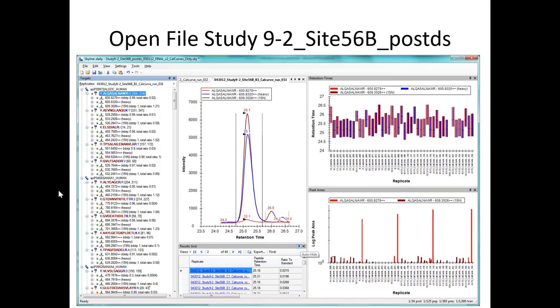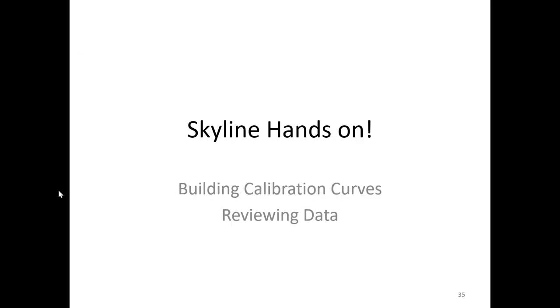Okay. So we've got 40 minutes to do some hands-on work, and we'll be building calibration curves and reviewing data from one of the CPTAC studies. Are there any questions so far about all that?